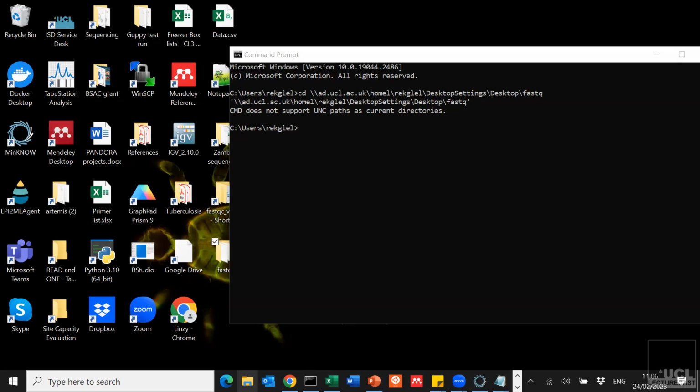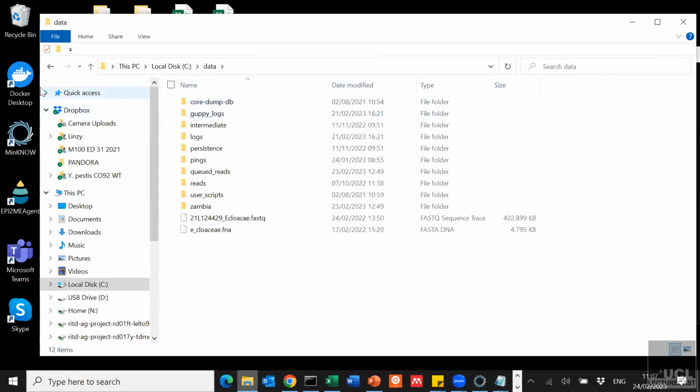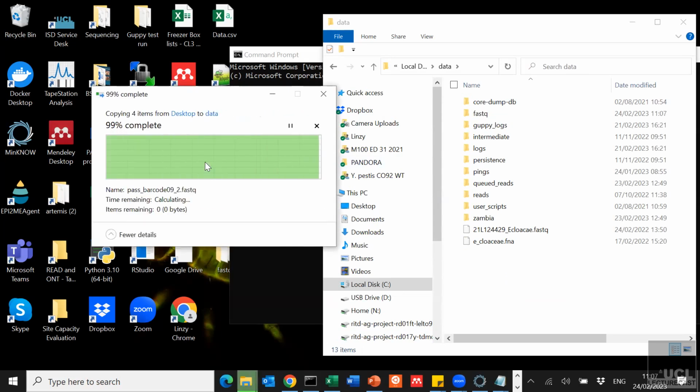Yeah, so what you will have got is all of those files that you've base called. When you start a sequencing run, you can ask it to put your files in a certain size. So as the default, it sets them at 4,000 reads, but obviously if you've got millions and millions of them, you're going to have lots and lots of files.